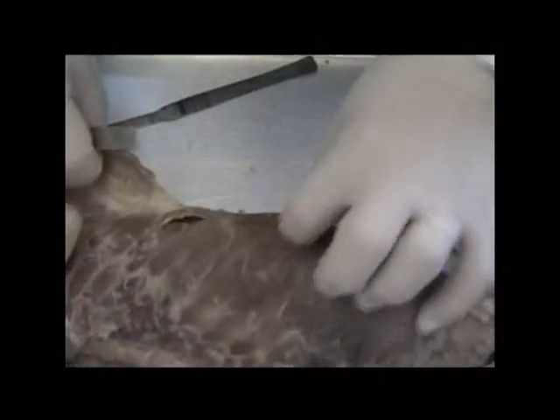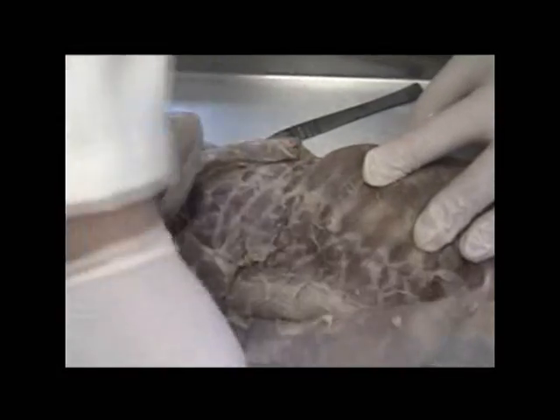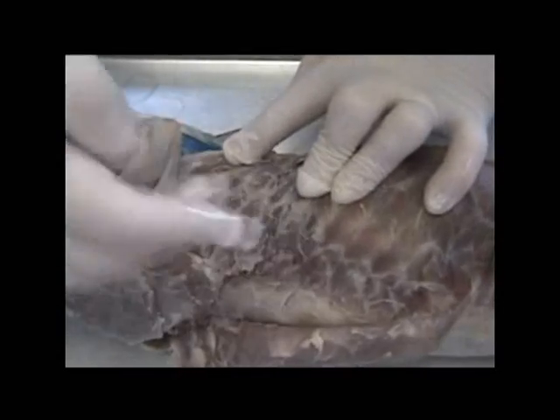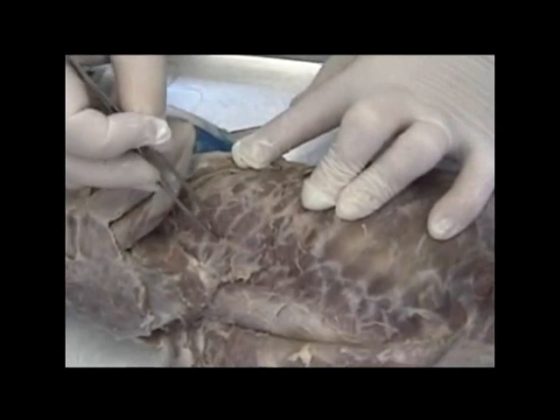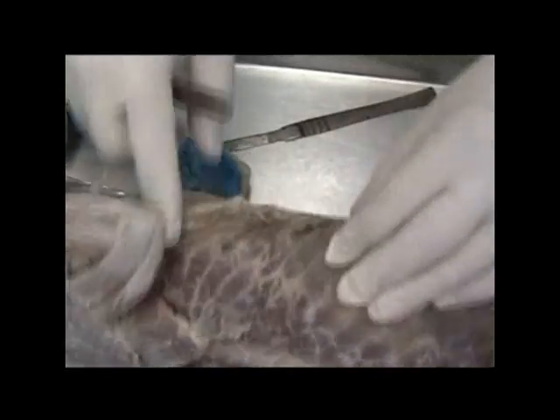If we start to move up into the chest and looking at some deeper muscles, we took the latissimus dorsi and we folded that back as you saw before. You notice a set of muscles up here that look very much like fingers pointing in this direction, giving this kind of serrated effect to it, and this is the serratus ventralis on the cat. In the human it would be the serratus anterior, but we see those nice serratus muscles there.